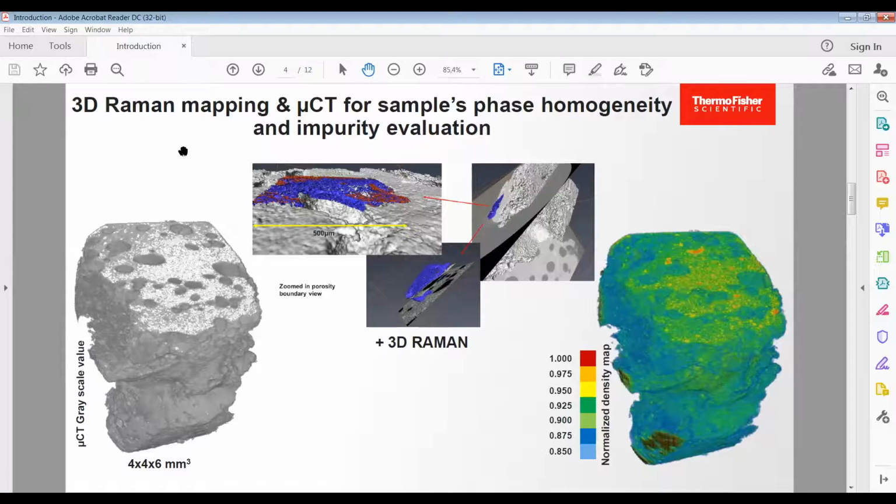Now, the problem with these kinds of materials was that they have to have at the same time extremely good thermomechanical properties, but they're extremely highly porous. Therefore, the porosity in these materials is mainly above 94%, and porosities are multi-scale, and the distribution of pores within the walls, in size, morphology, and connectivity, defines the material's properties.